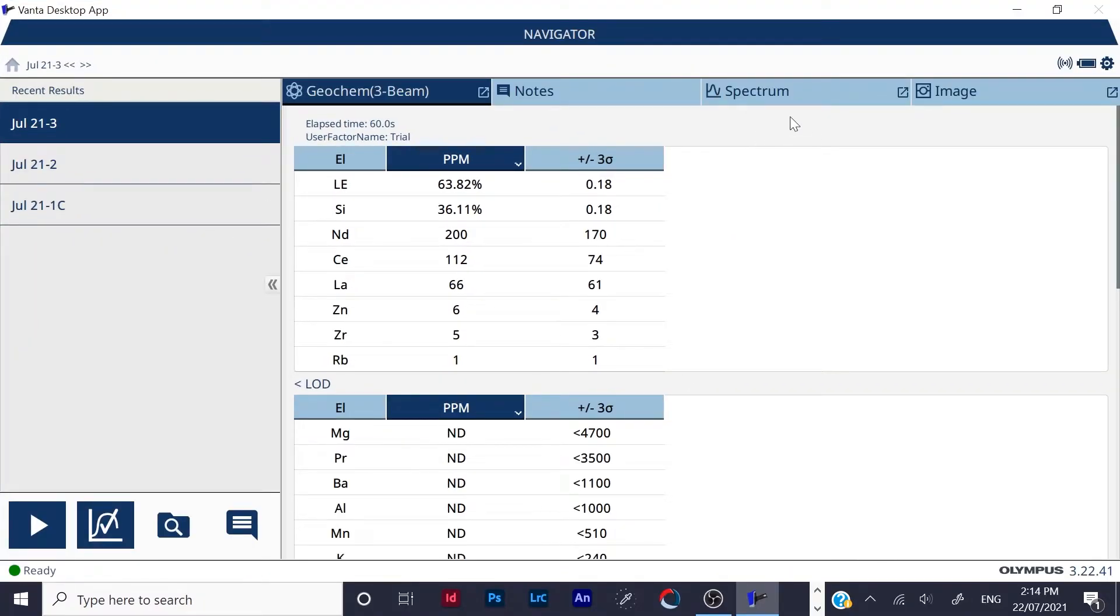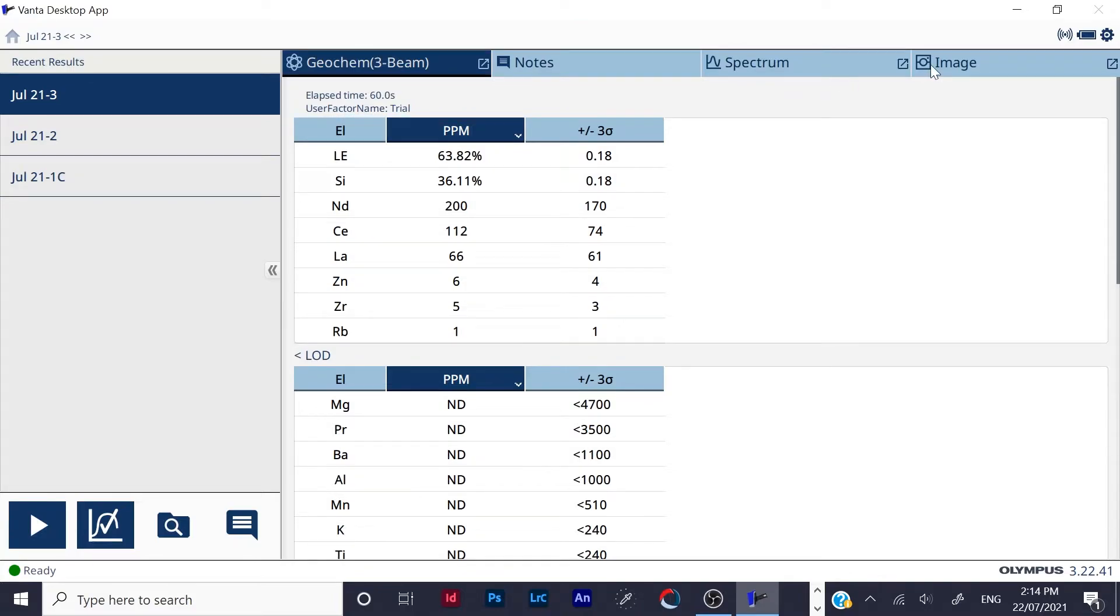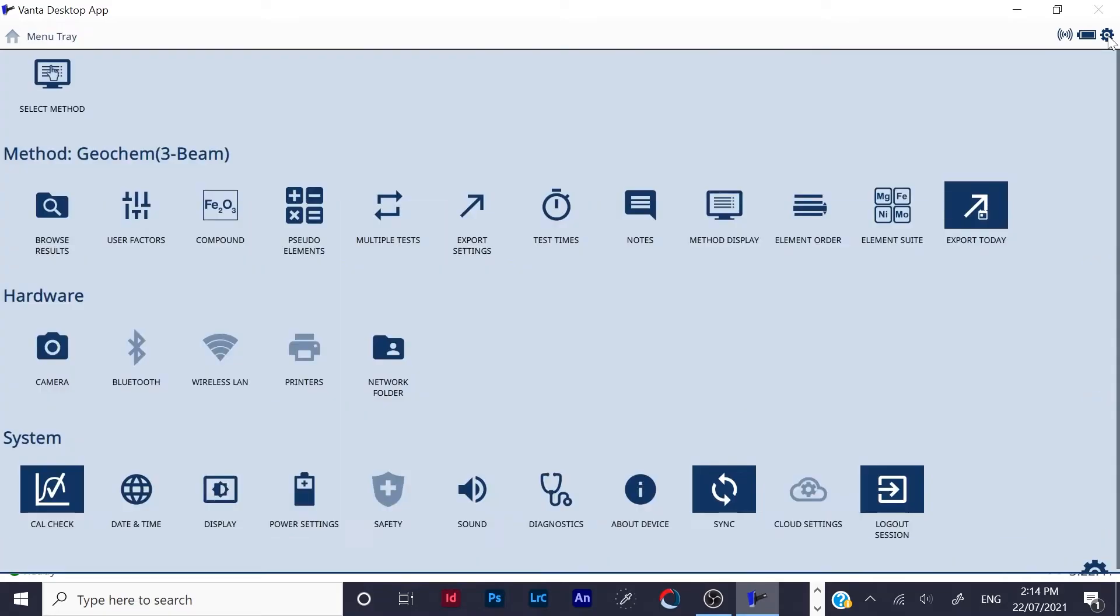Right now, you want to come up here and click on the cog in the right top hand corner. It brings down the menu settings, which you then want to go over to export settings. Open that up.